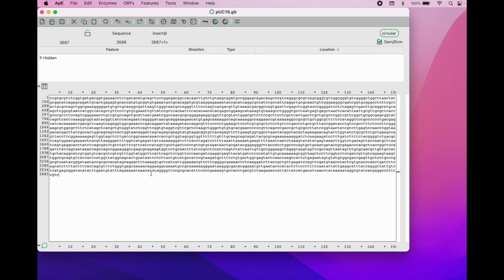So what we're going to do today is we're going to look at restriction enzymes. And so you learned a little bit about this, where these are enzymes that can very specifically bind to a DNA strand based on maybe a 4, 5, 6, 7, 8, 9, 10 nucleotide sequence, all right? And they're very specific in their binding. And once they bind to that DNA, they can actually cut that DNA in a particular way, right? So they can actually cause a cut, kind of like molecular scissors, and separate that DNA, right?